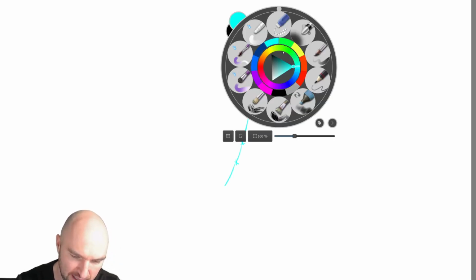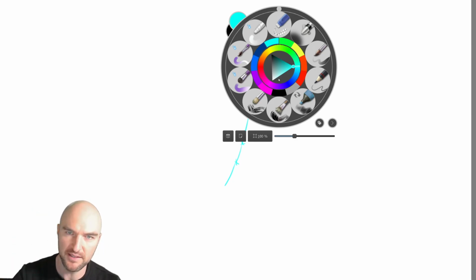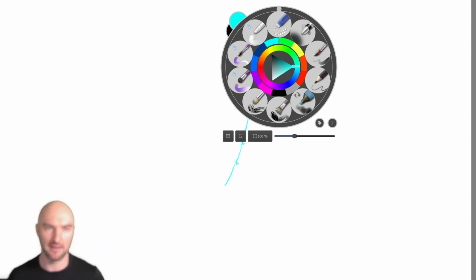So we have our interface, and we've defined with those 4 nanometers what our interface is. I should have maybe made it a little bit thicker than that. Maybe I'll make it 8 nanometers. We get a bit better statistics.